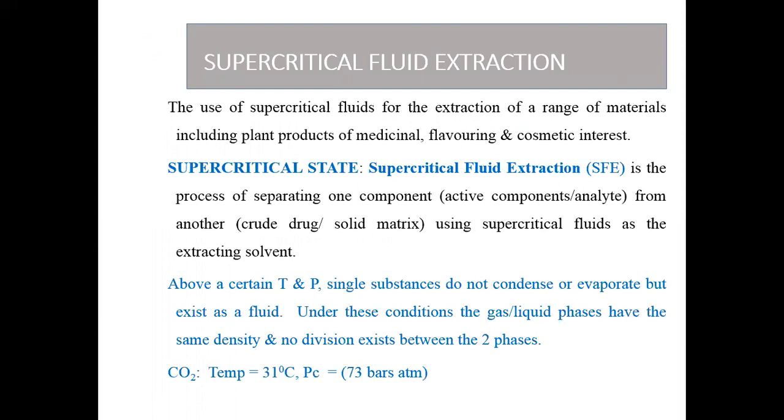Supercritical fluid extraction: the use of supercritical fluid for the extraction of a range of materials, including plant products of medicinal, flavoring, and cosmetic interest. Supercritical state. Supercritical fluid extraction is the process of separating one component, such as active components or analyte, from another, from a crude drug, using supercritical fluid as the extracting solvent.